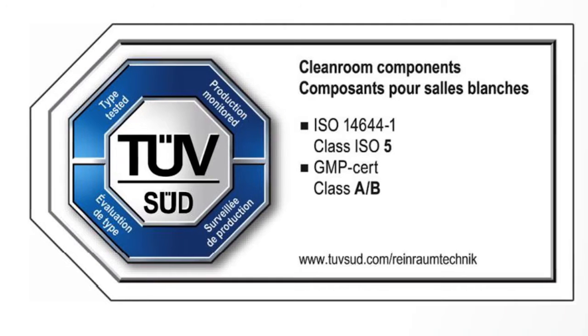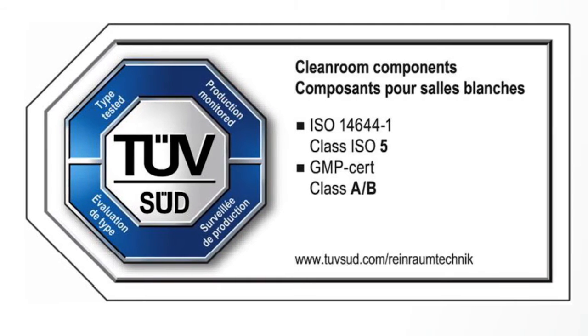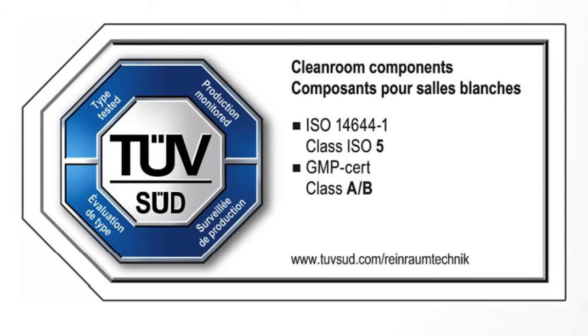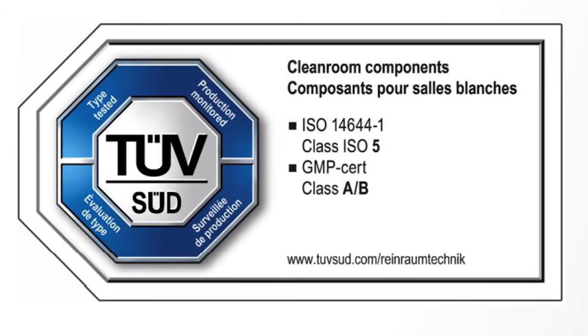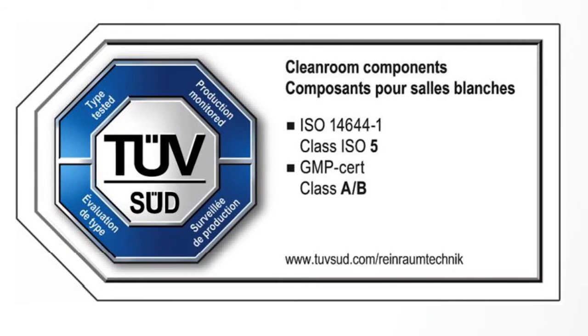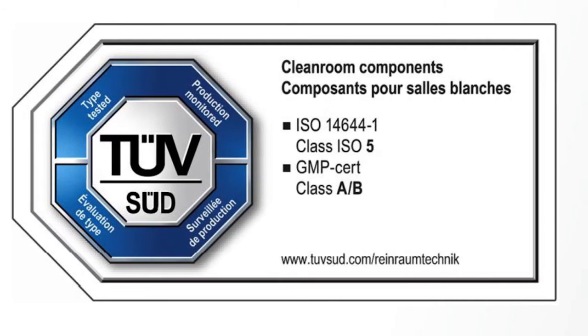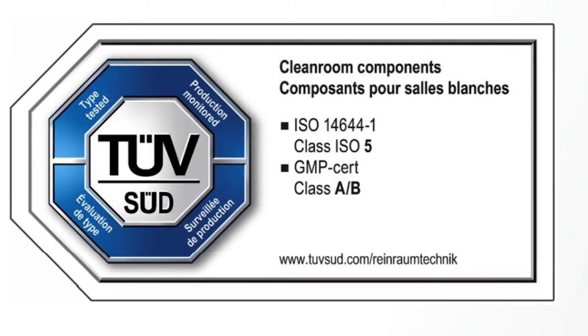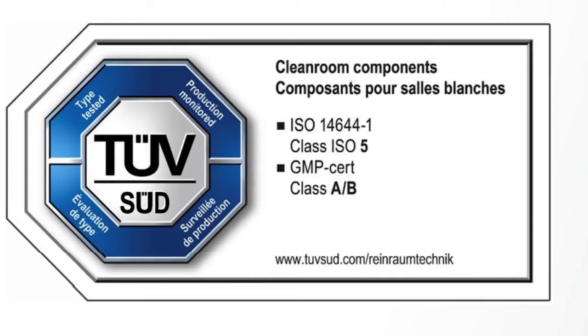So we've partnered with our third party, TÜV SÜD, to validate independently that this product can be used in both an ISO class 5 and a GMP grade A and B setting.